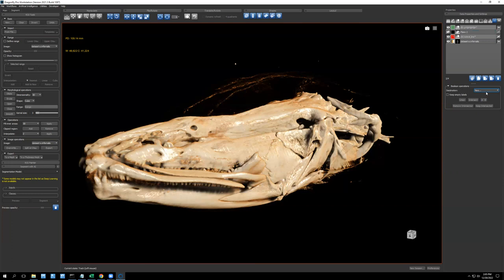Can A also be two segmentations that you select simultaneously, and then subtract a third one from the two? Yes, you can combine them. That's union. If you wanted to combine something, you create union, and that creates a new segmentation that is both of those things. Then you select a third thing to remove it from that union. Also intersection would take two segmentations and create a segmentation that includes only where they intersect. You can also remove intersected and keep intersected.